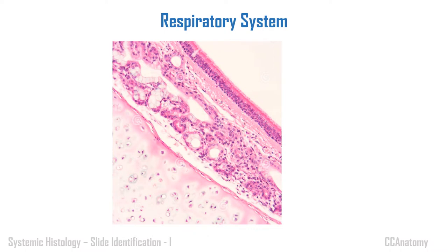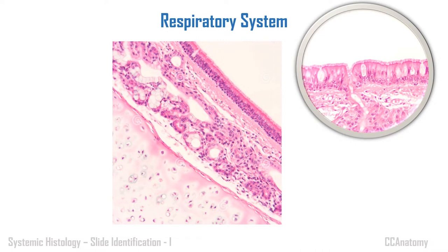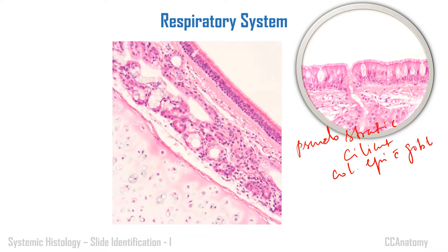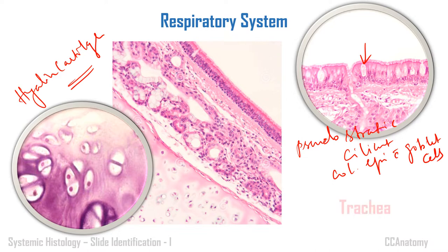In the respiratory system there are only two slides. If you've seen the first two videos, you can clearly identify the epithelium. This is the pseudo-stratified ciliated columnar epithelium with goblet cells. You can make out the goblet cells, and one more thing you can see is the hyaline cartilage. The only slide which has both these features — pseudo-stratified ciliated columnar epithelium with hyaline cartilage — is the trachea.